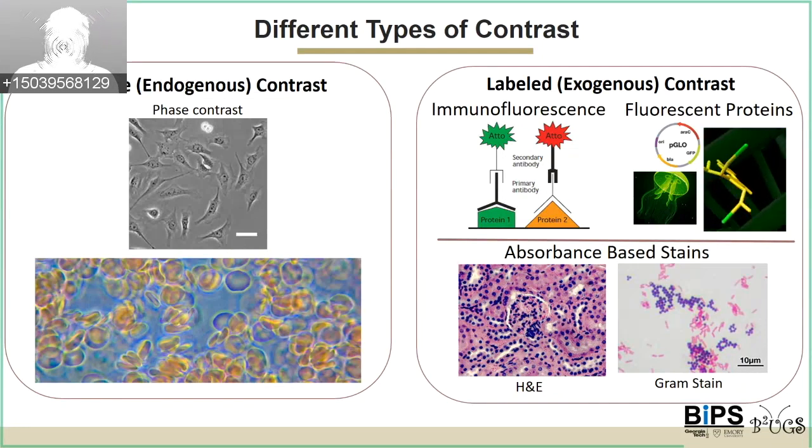There are also absorbance-based dyes, such as those used for H&E and gram stains. I won't be talking any more about this type of contrast, but feel free to ask questions at the end.